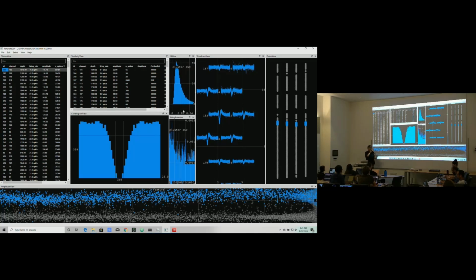When you compute ISIs, inter-spike intervals, it's always between consecutive spikes. Whereas when you compute autocorrelograms, it's between any two pairs of spikes, whether they're consecutive or if there's a spike in between, it doesn't matter. You're always doing these histograms. And so these should tend to look empty in the middle, and then they gradually rise up to some constant baseline rate of coincidence between two spikes.